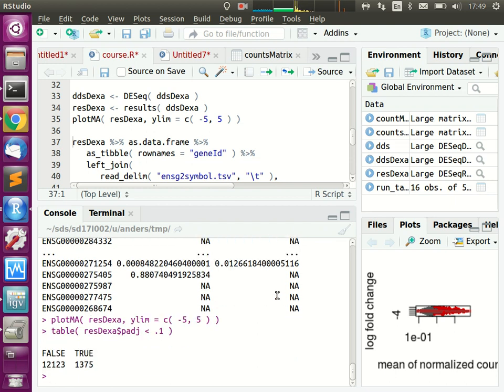What do you do with so many genes? Most people use these, and then go into one of these gene set enrichment tools, where you look at all the genes and ask, are these genes enriched for certain gene sets? For example, are there more than the average amount of genes in the extracellular matrix, or genes which are part of a certain organelle, or genes which are part of a certain signaling transduction cascade, or whatever. And this might give you a hint of it.